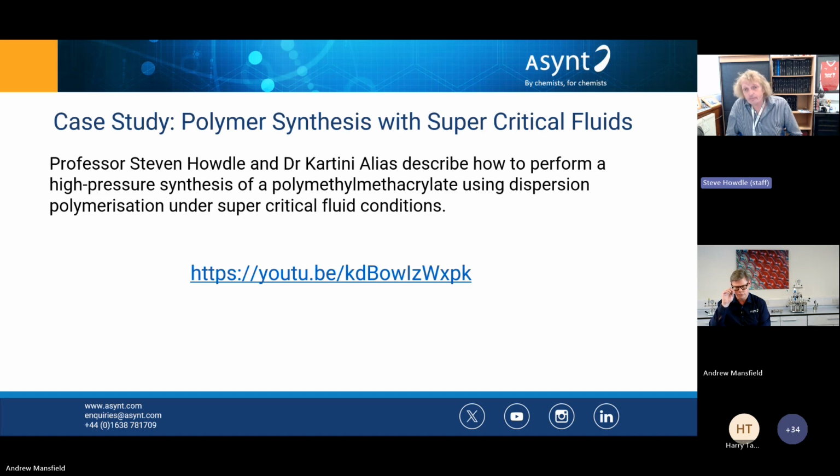But these high pressure processes are really quite common around the world. So supercritical CO2, as I said, it's around about 300 bar and up to, in our case, up to 125 degrees C. And we're working in our lab in scales of around about 60 to 100 milliliters. We have designed a vessel that's 1 liter that we use for our scale up. And that's quite a big step up, but that helps us to take things towards commercial processes.